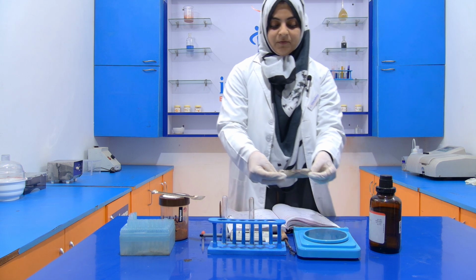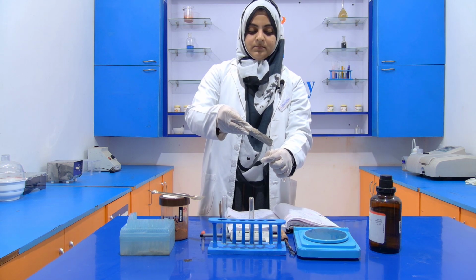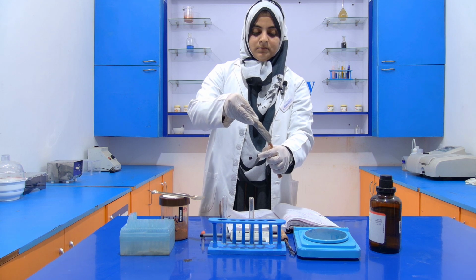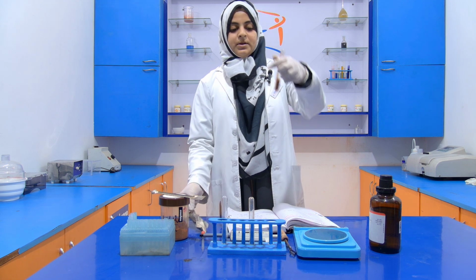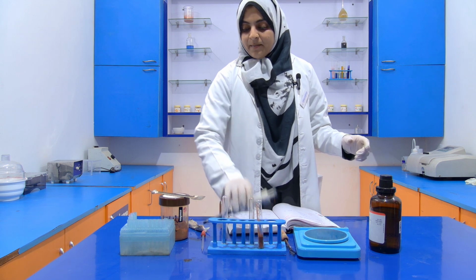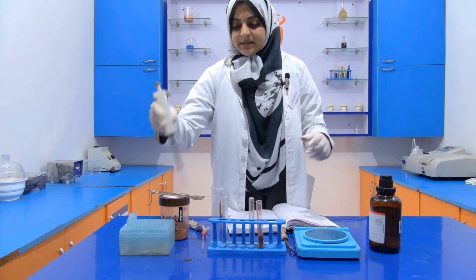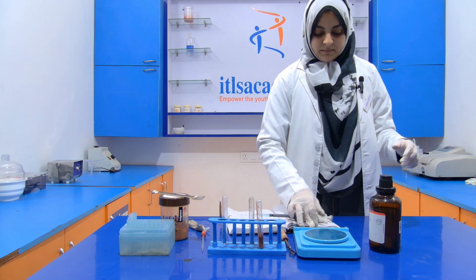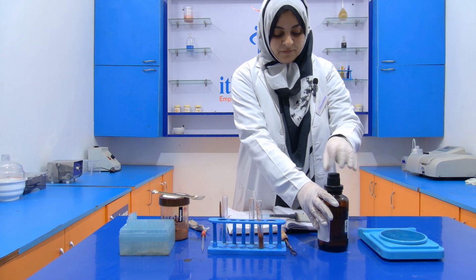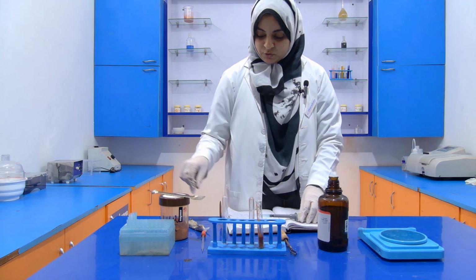Transfer it very carefully. Okay, now you have to add 5 ml of acetone into it. Sorry, 5 ml acetone, not acetate.